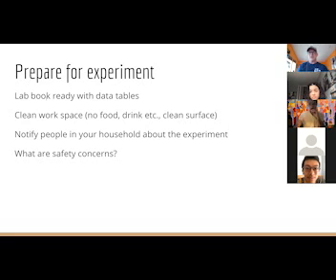That's going to be really critical because we don't want any, and who's got contact lenses? Anyone wear contact lenses? Anybody? Nobody wears contact lenses? Dang. If you do, don't have them in when you're doing experiments.